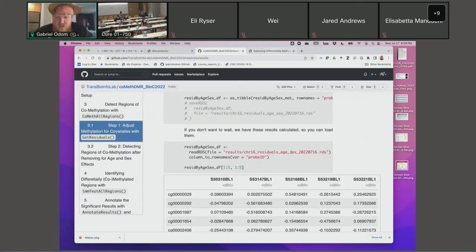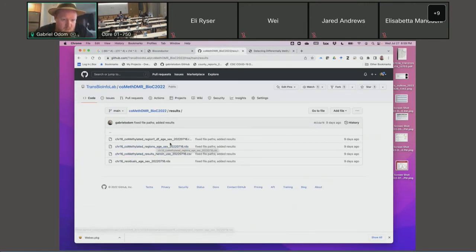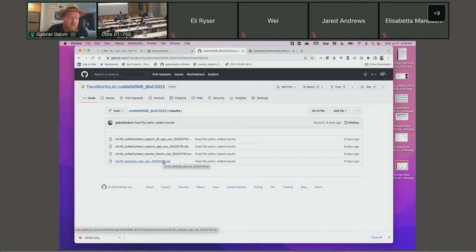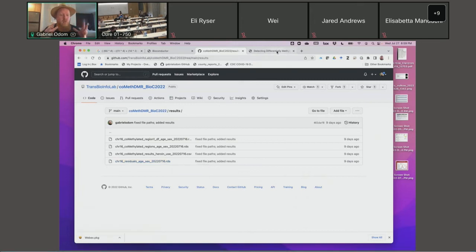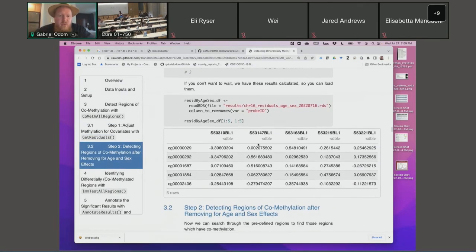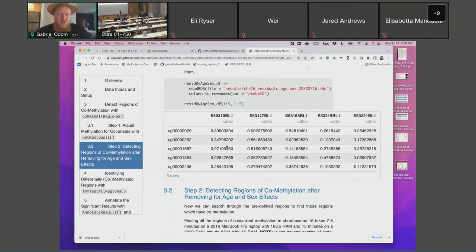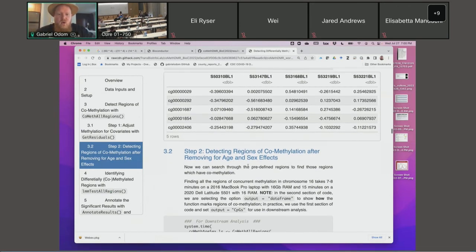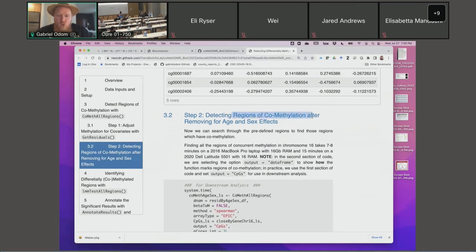So residuals by age and sex — that is this transformed methylation values data set. It's the residuals of the methylation, not the original. And that's what we want to do the clustering on — we want to see what the clustering looks like once we've controlled for how old they are and whether they're male or female. These are not methylation beta values anymore — these are residuals, in the M value space, so they can go from negative infinity up to positive infinity. And so we look for areas of co-methylation.